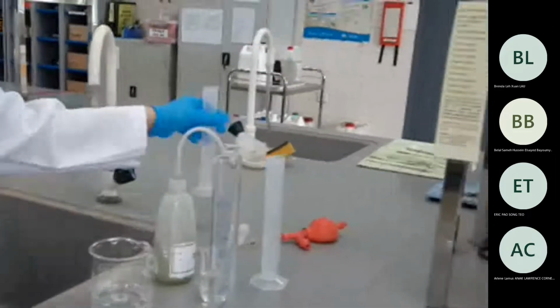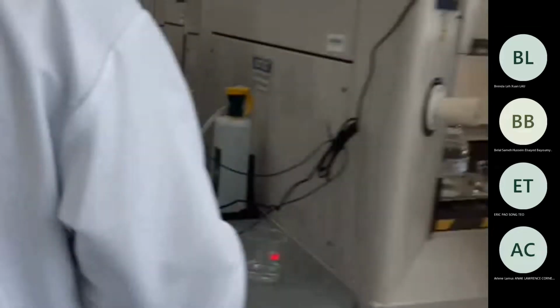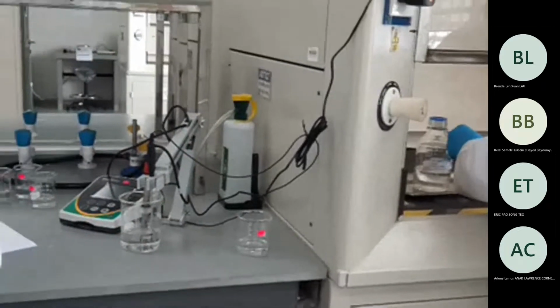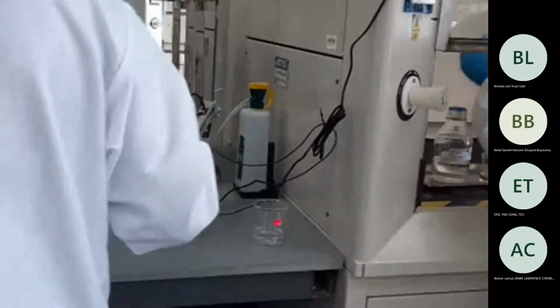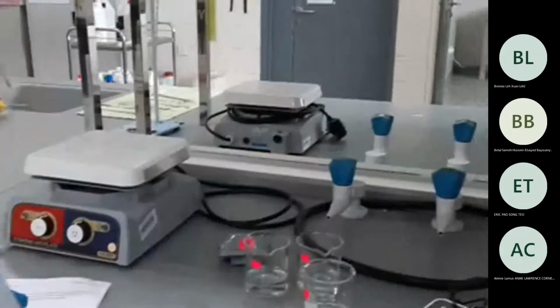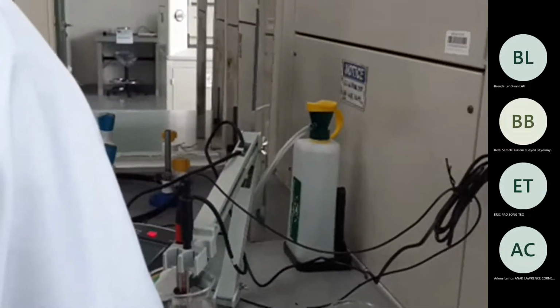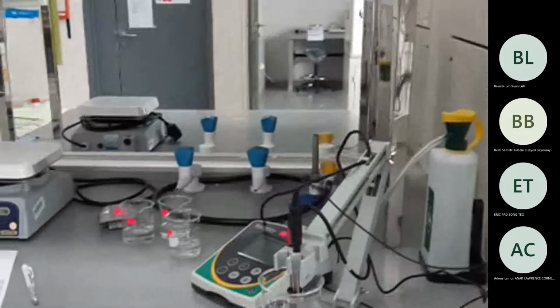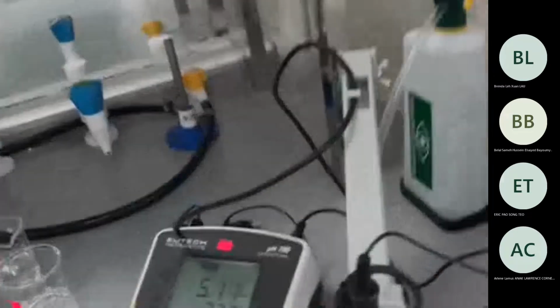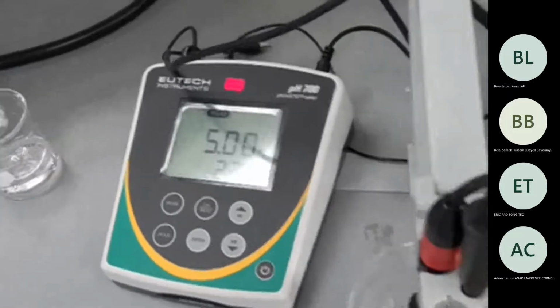So now your buffer solution is prepared. You have to take the reading first of the pH from here. 0.3, is it? Actually it is 5.